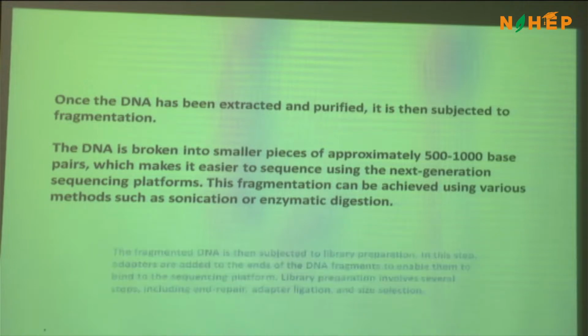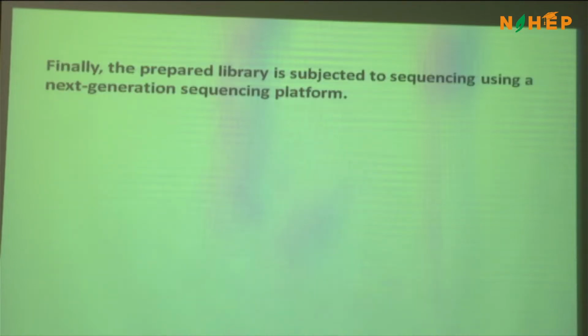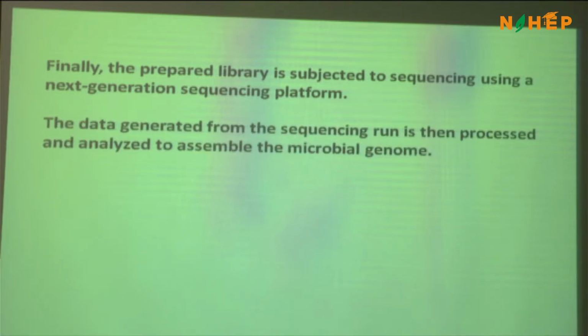Okay, and finally, of course, the reads come to you, and how to curate those sequences was already handled very elegantly by Guillermo and Luisa. The ends are trimmed, poor quality reads are removed, and the high quality base calls are taken on board for any further interpretation, right? So that has to follow certain pipelines, and most of the software and programs have already been communicated to you. Please follow that, right?